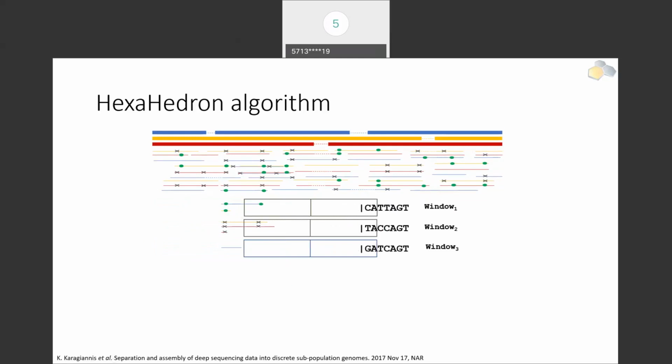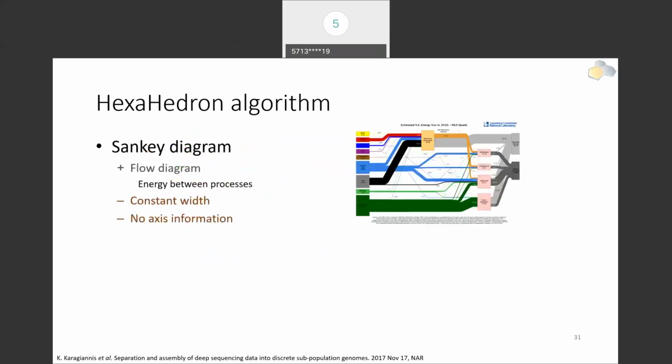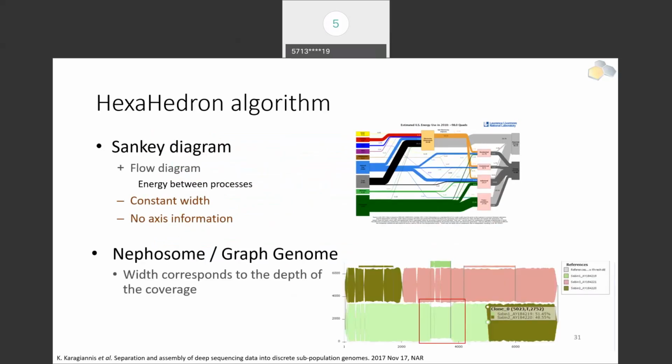And the second part of the window is used as a template for the next step. That practically creates a stepwise approach for this algorithm. So it's a sliding window. And you'll see where I'm going with this and how this is linked to the DVG.